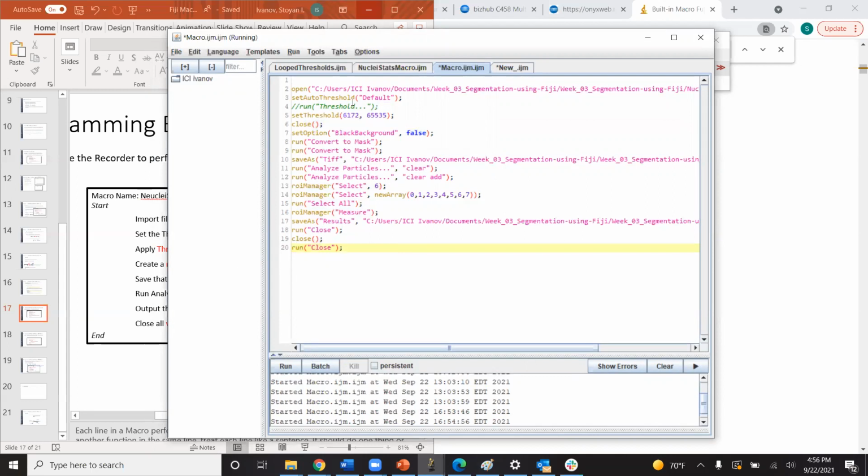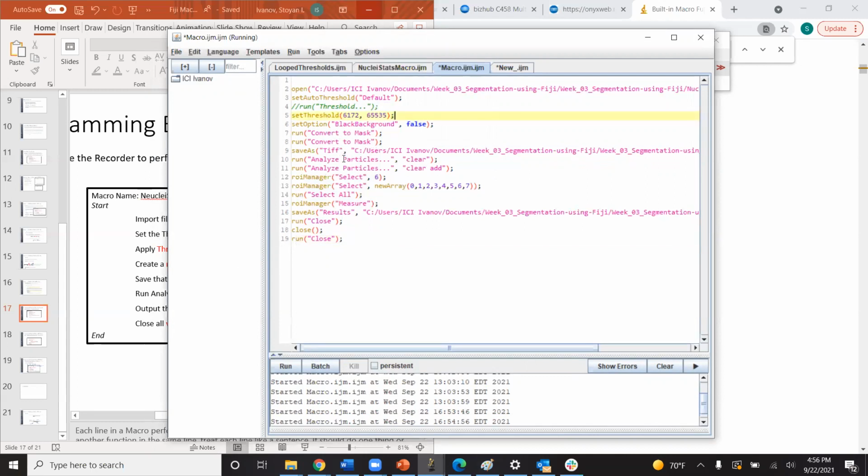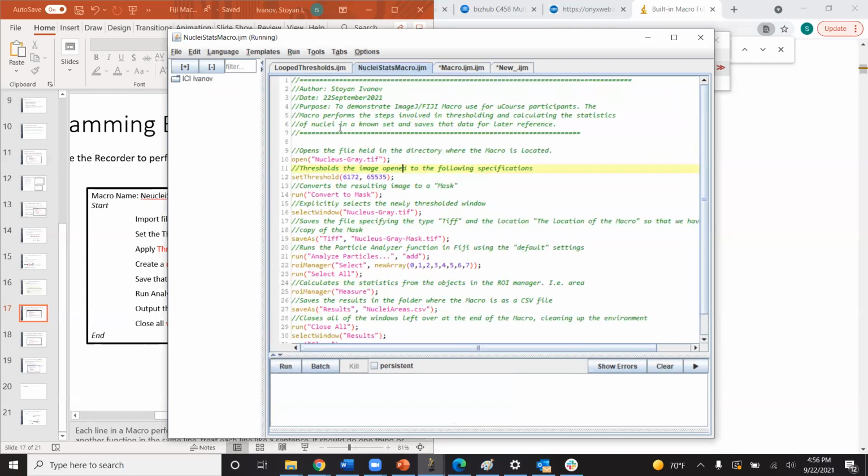Now, we've got all the commands here, and they produce what we wanted. However, this code not only has some redundancies like lines 7 and 8 here, it also is not very readable. So at this point, once you have a skeleton that works, you would want to spend some more time looking through it, making sure you understand what's happening and making sure it's being done properly.